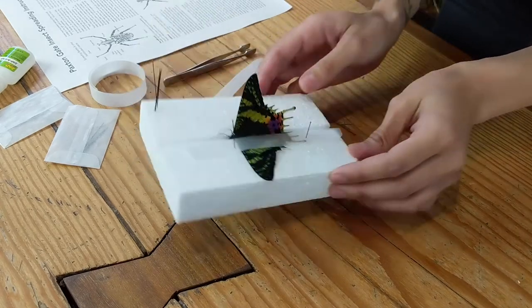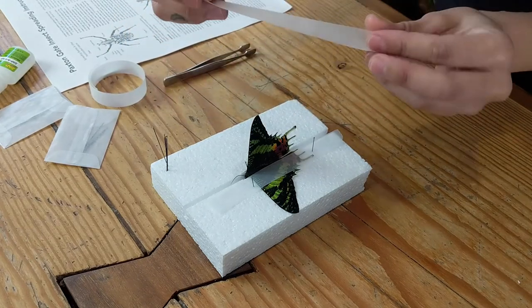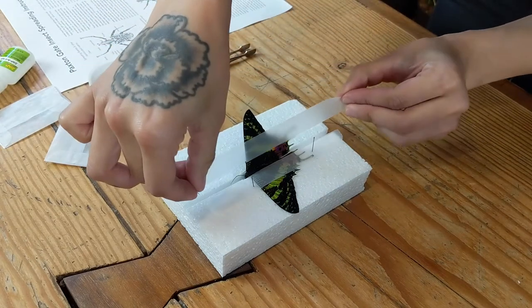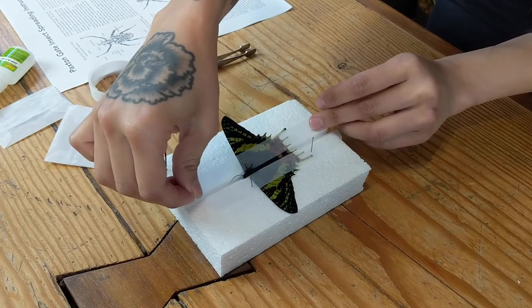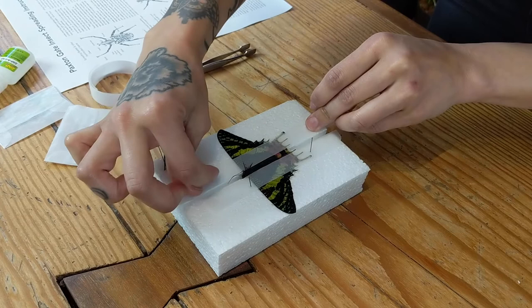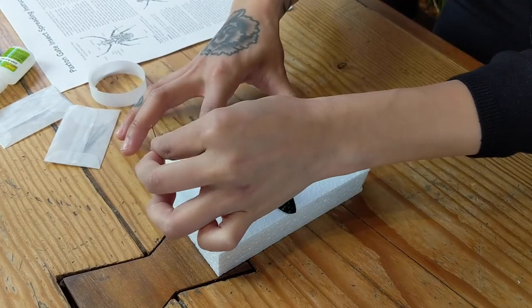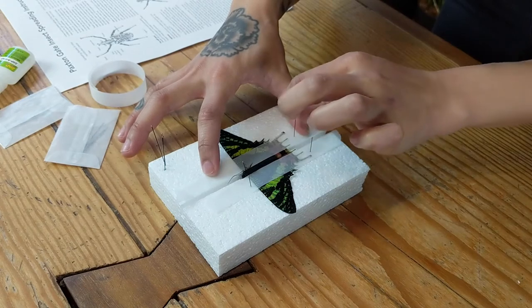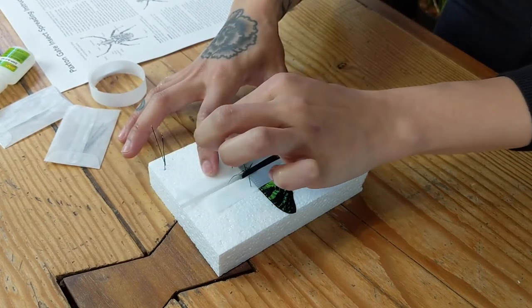Going ahead and leaving it there, and moving on to the opposite side of the wing with another piece of parchment paper, carefully pulling this side of the wing down and using the same technique — placing one number two pin below the hind wing and one above the fore wing.